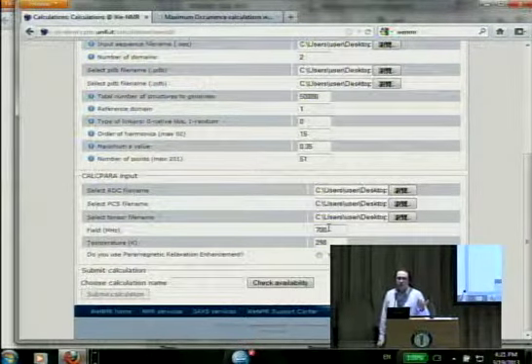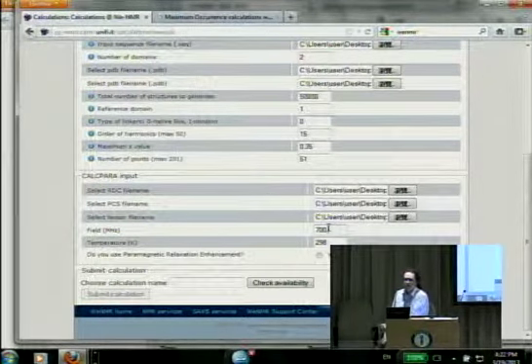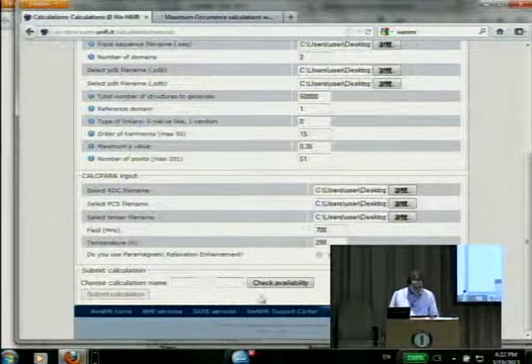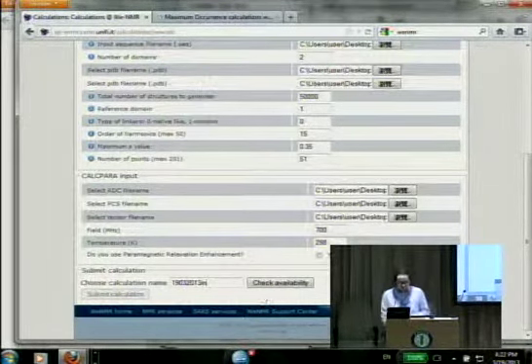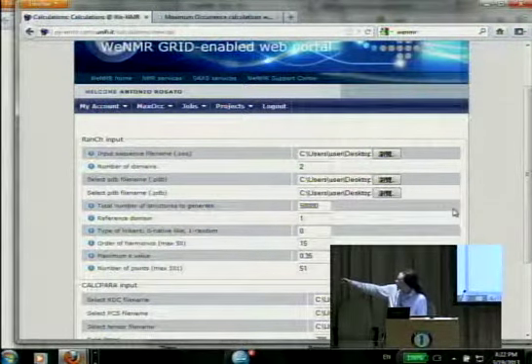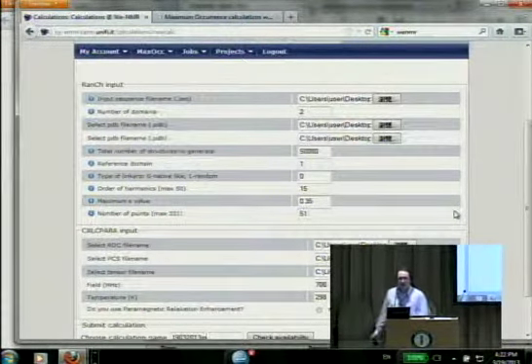So basically, to wrap up, the important parameters are the sequence and the two domain structures. You have to tell the program the structure of the two fixed rigid domains, and how many configurations you want to generate. Of course, the larger this number, the longer all the calculations in the subsequent step will take, because it will be randomizing from a much larger pool. And then you provide the input data. Let's see if it gets submitted.